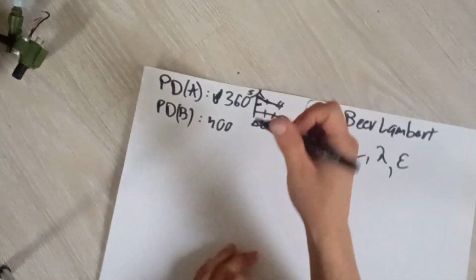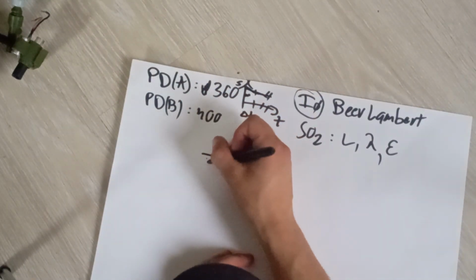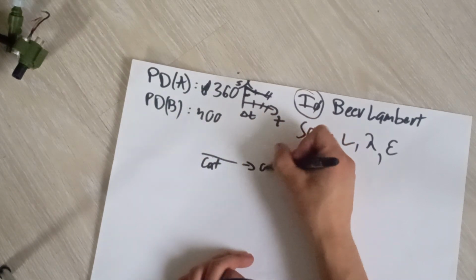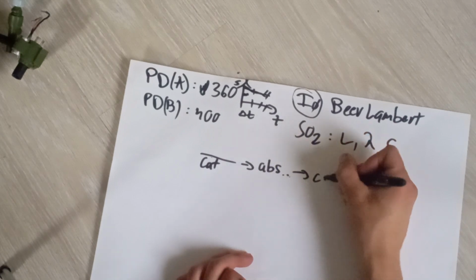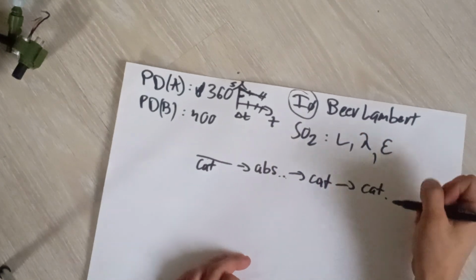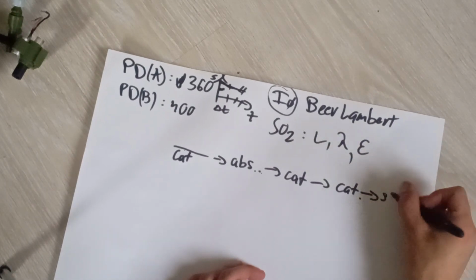And we have three catalysts. Going from left to right: a catalyst, then an absorber and other things, then another catalyst, then another catalyst, and then a scrubber.